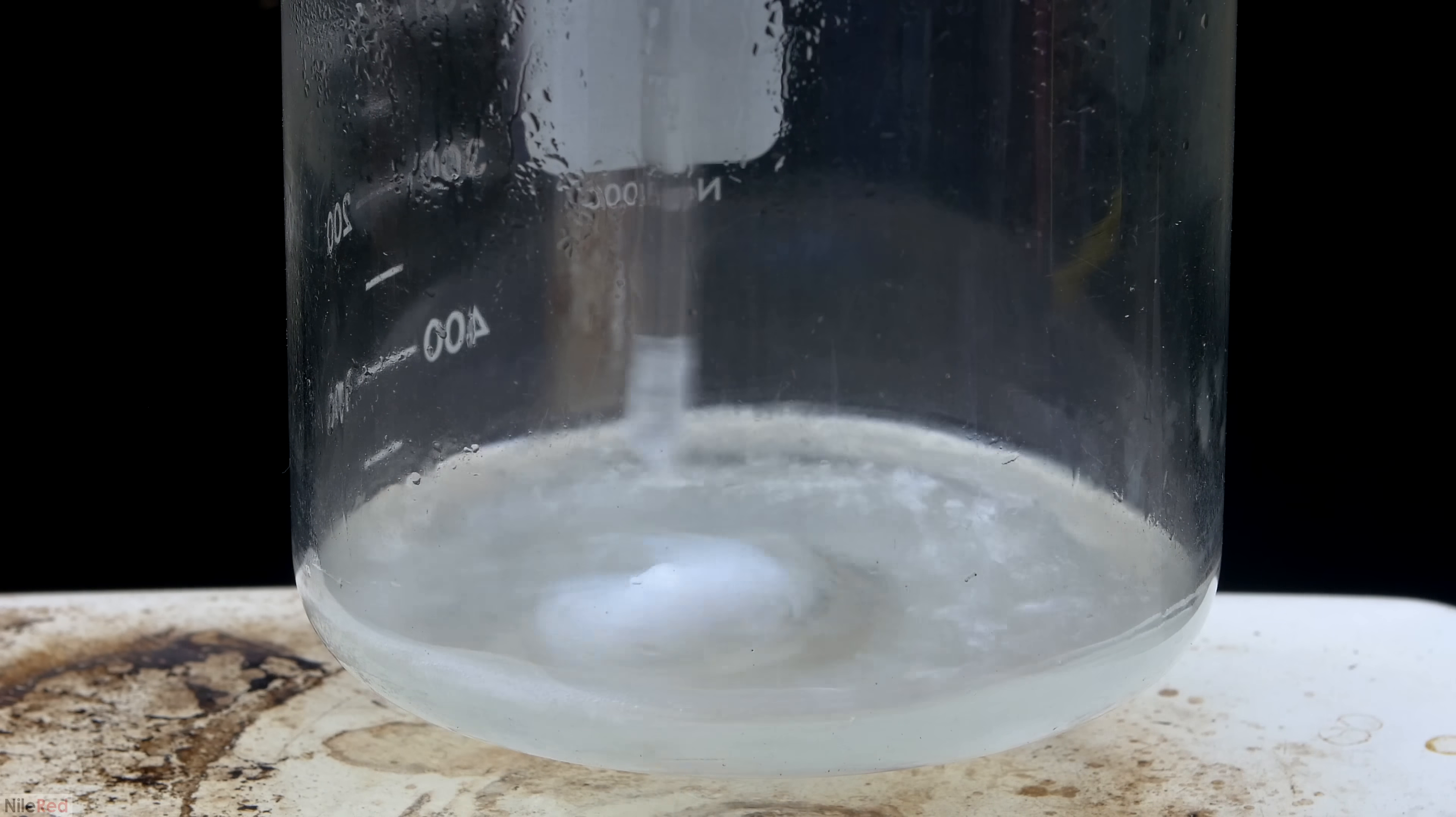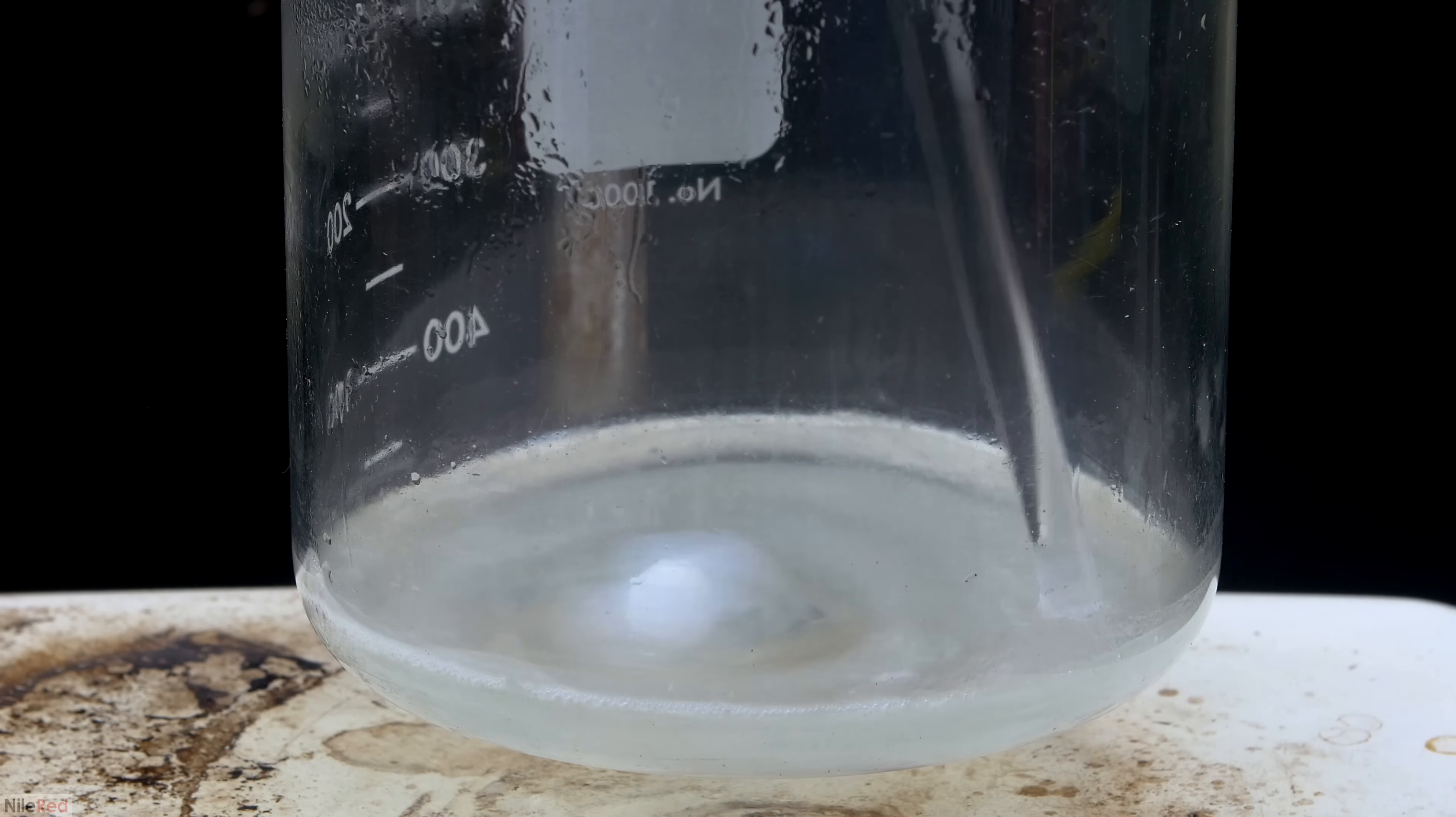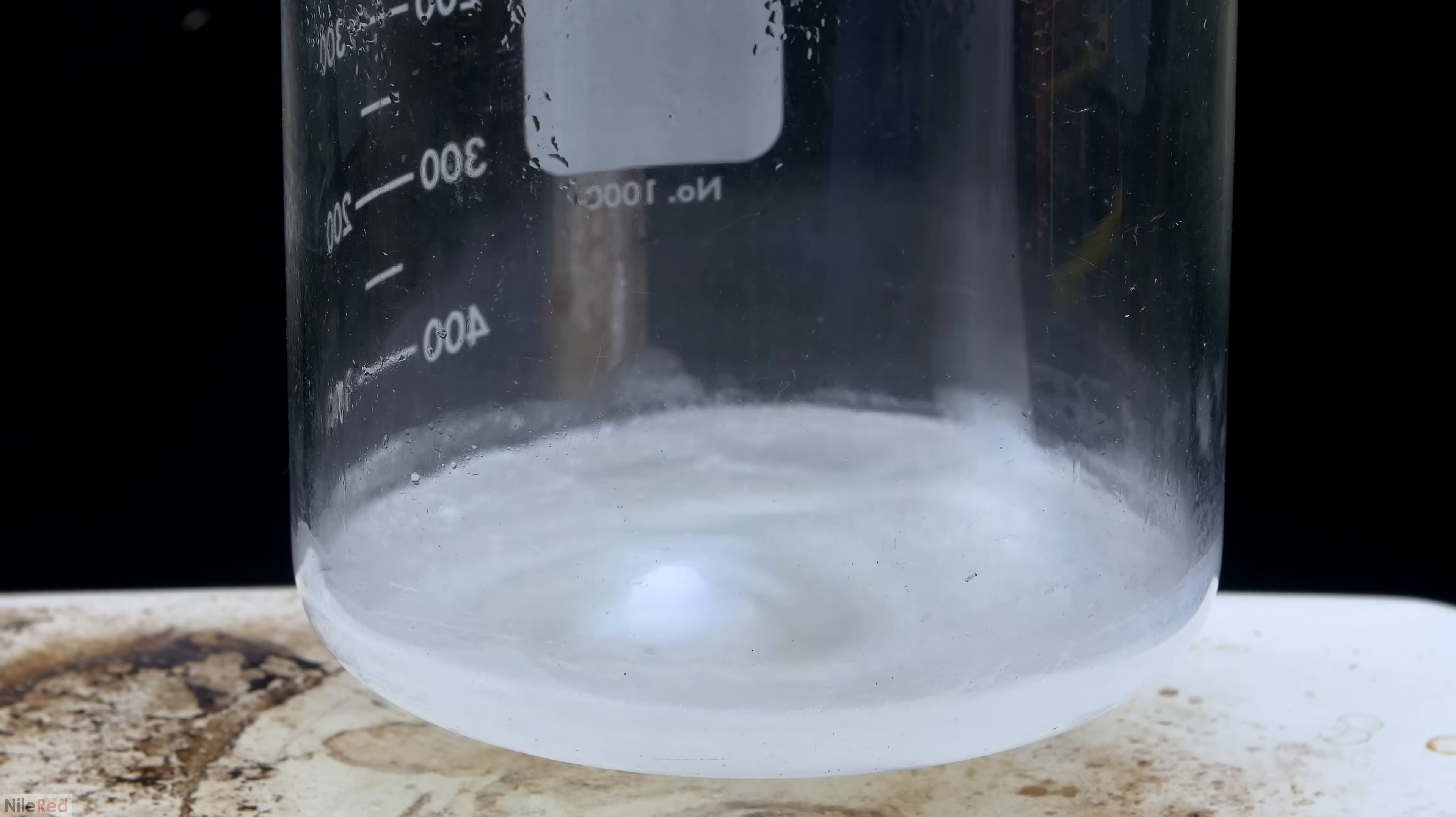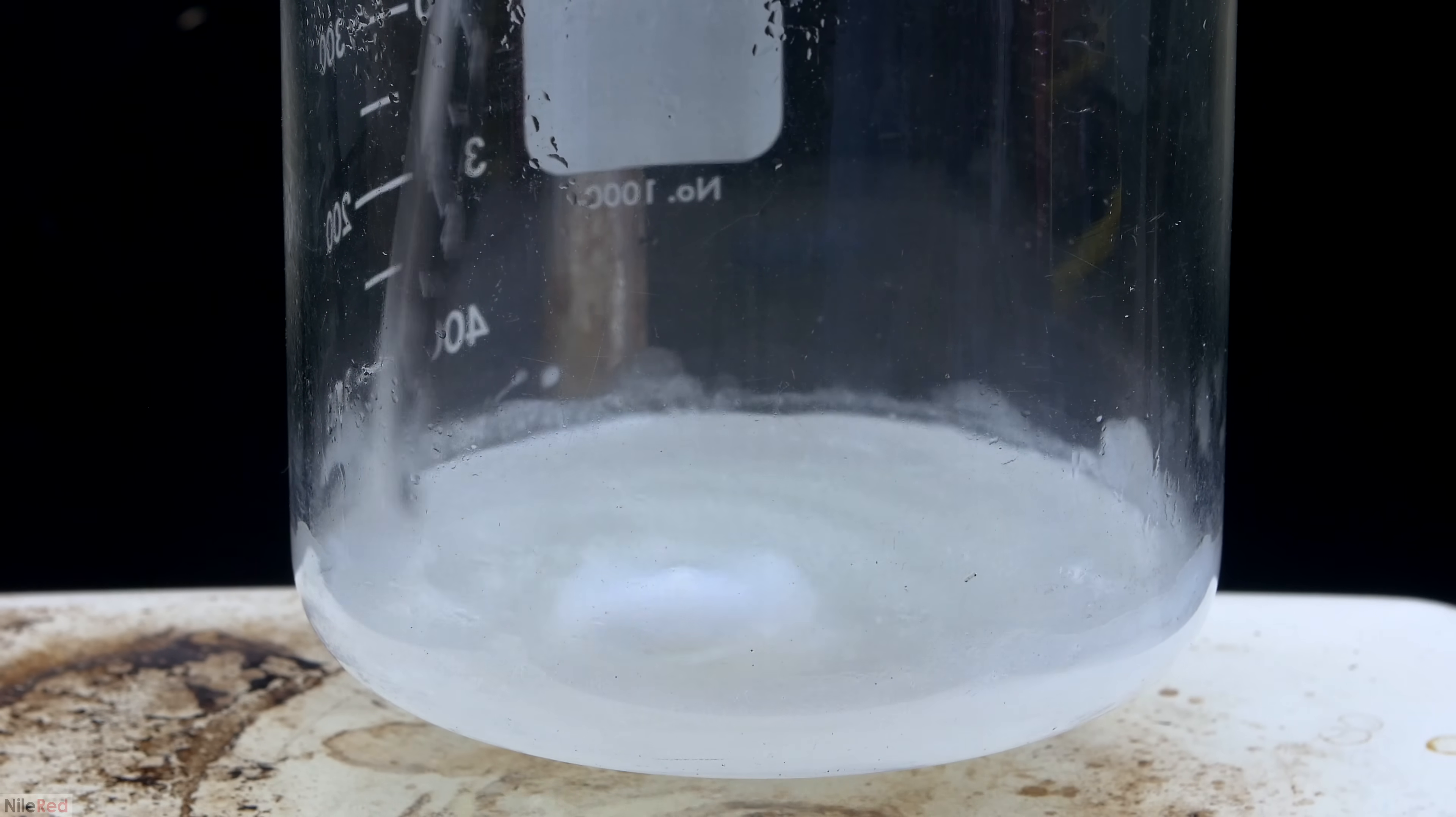The anhydrous form of mercury(II) nitrate doesn't melt at such a low temperature, so it crystallizes out as a solid as soon as it forms. This final drying step of our mercury(II) nitrate is extremely slow, so it's important to have patience.